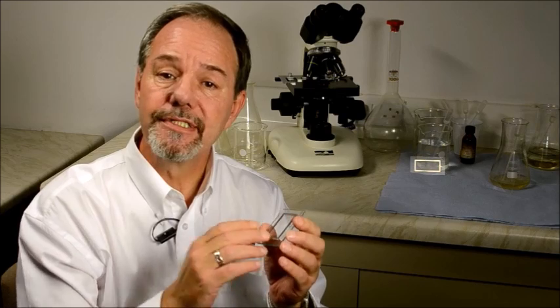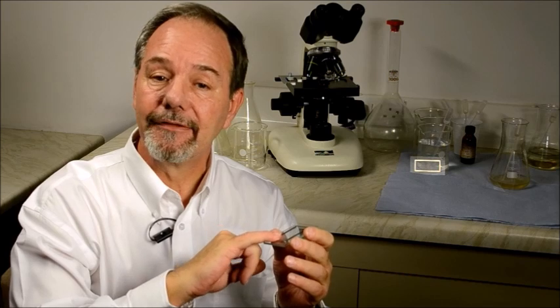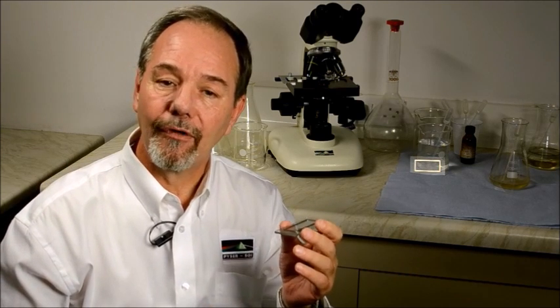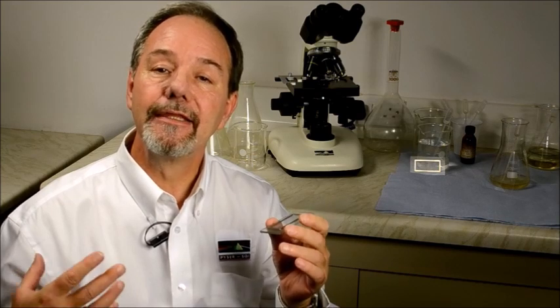The Centric Rafter Counting Chamber is a traditional and commonly used tool employed for water analysis and culture inspection. Its application enables the enumeration and identification of algae or zooplankton suspended in water. The chamber holds a known volume of liquid, which is intended to be representative of the largest volume of the sample, which in its turn is representative of the sample source. The principle is to take a representative sample of the source, and then by preparing and preserving the sample, a small quantity can be examined under the microscope. The results of a species count in that small known volume, possibly repeated and multiplied, can then be scaled up to produce an estimate of the volume in the sample as a whole.